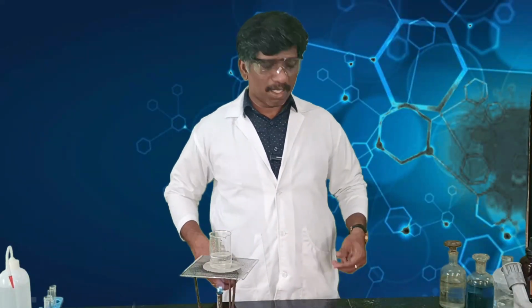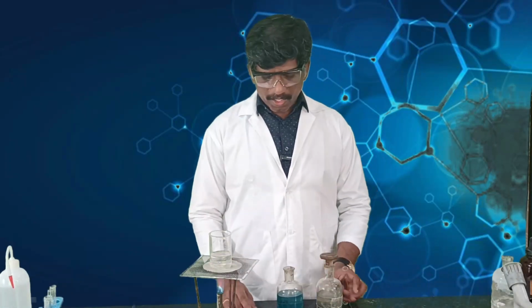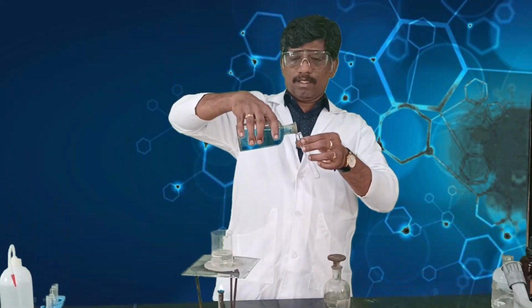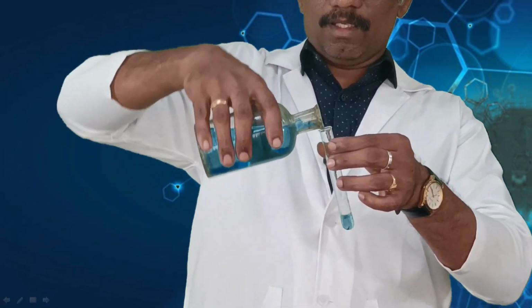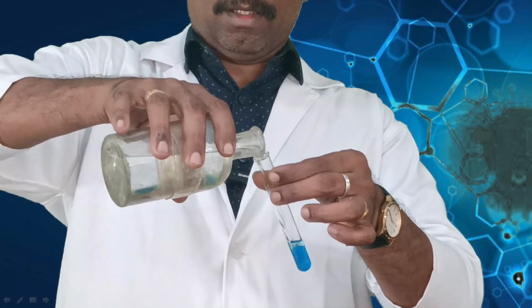Another test to confirm the presence of carbohydrate is the Fehling's test. For this test, you have to take Fehling's A and Fehling's B. Take equal amounts of Fehling's A and Fehling's B. This is Fehling's A and Fehling's B. Equal amount of Fehling's A and Fehling's B is taken.